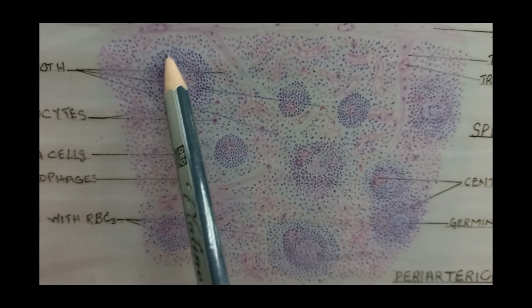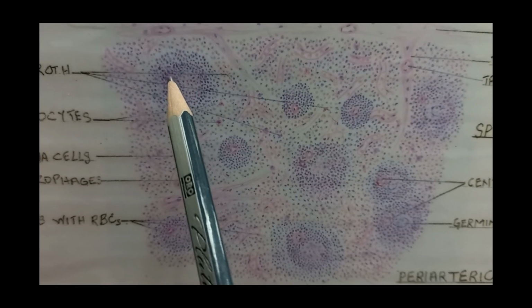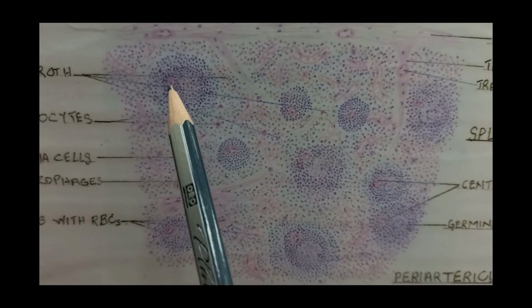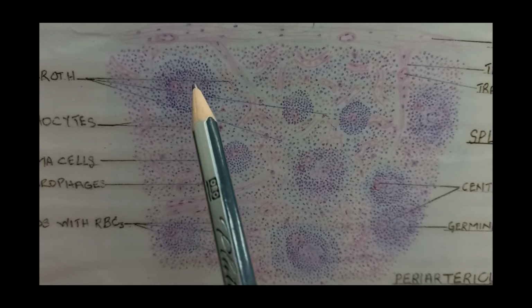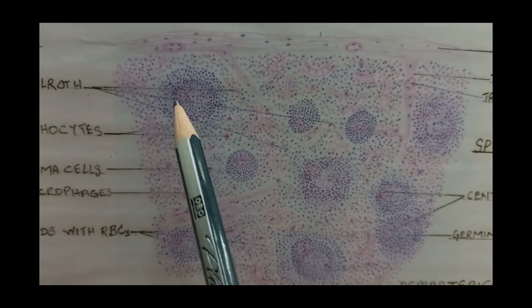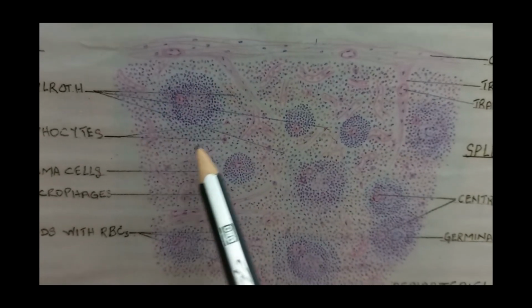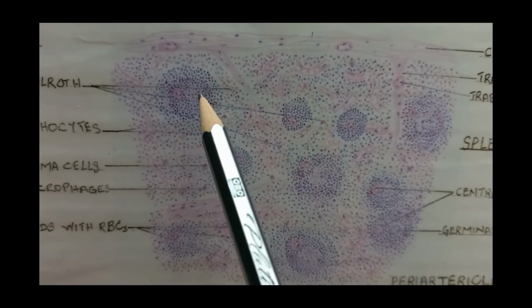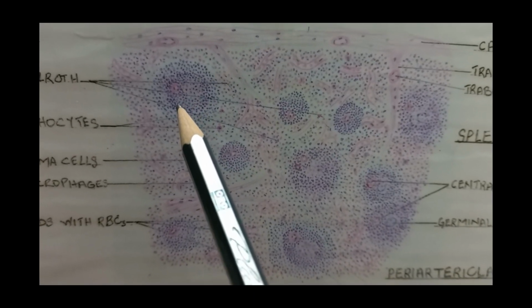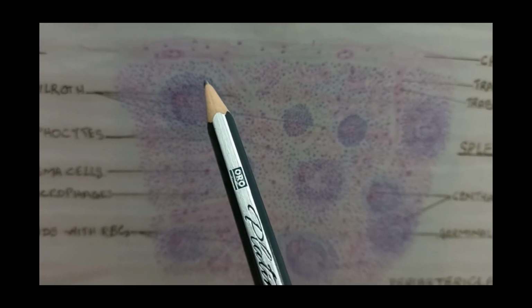So these are the secondary lymphatic nodules where the branches of the splenic artery are present, and the branch of the splenic artery that runs through the periarterial lymphatic sheath is the central artery. You will not draw it in the center but on the peripheral side, but its name is the central artery. The white pulp is also surrounded by a marginal zone which has diffuse lymphatic tissue with T lymphocytes, B lymphocytes, plasma cells, macrophages, and you can also find here the marginal sinuses.